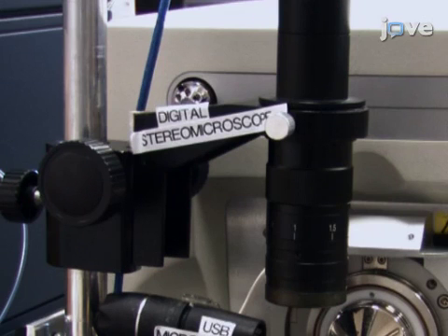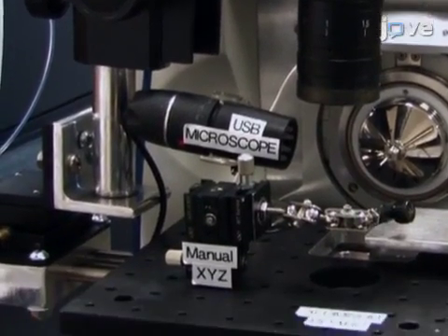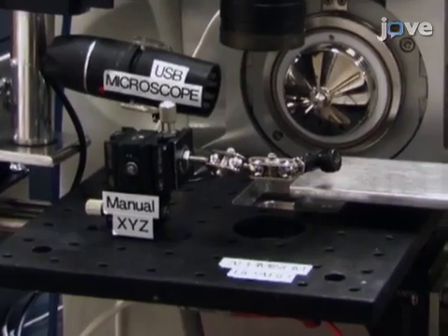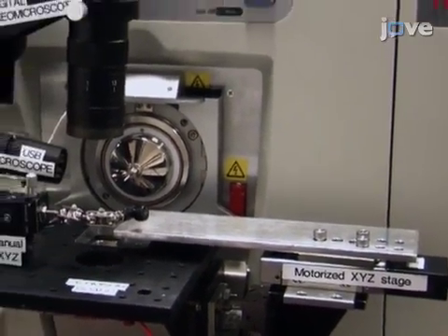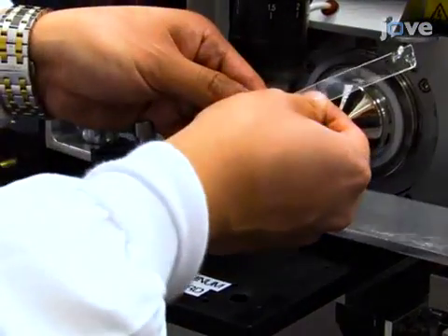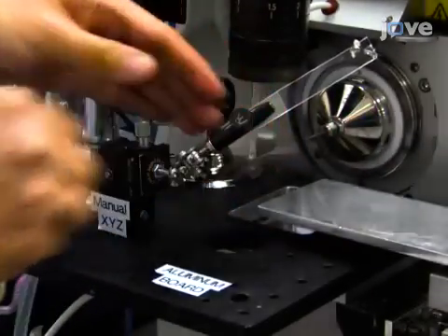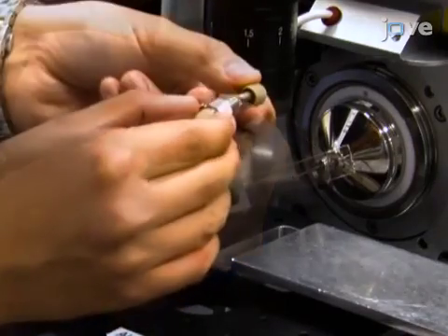Attach the modified digital stereo microscope, a USB digital microscope, a miniature manual XYZ translation stage with a flexible clamp holder, and the motorized XYZ translation stage system to the aluminum optical board. Use the flexible clamp holder to fix the glass slide attached with a single probe. Then attach the single probe setup to the mass spectrometer.